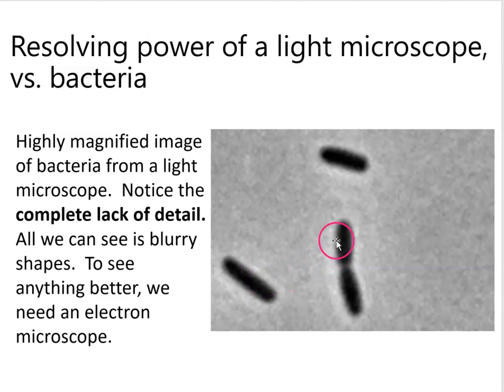Where does this cell start and end? You can't really pinpoint it because it's a little bit blurred. And that's because the resolution of this image really is not so far different from the size of one of these cells. So that's something we're going to see.